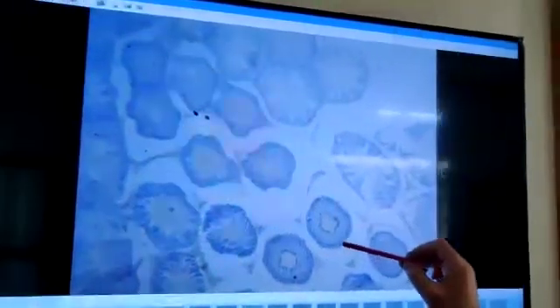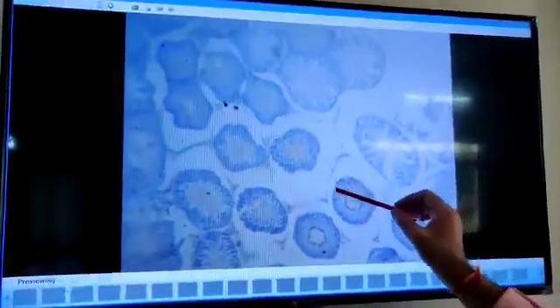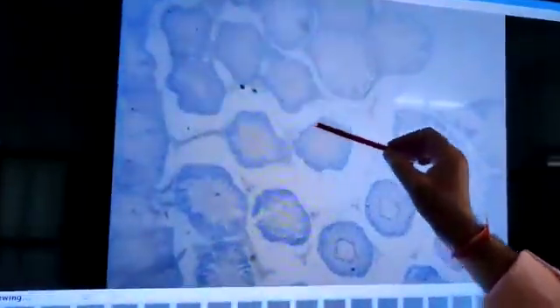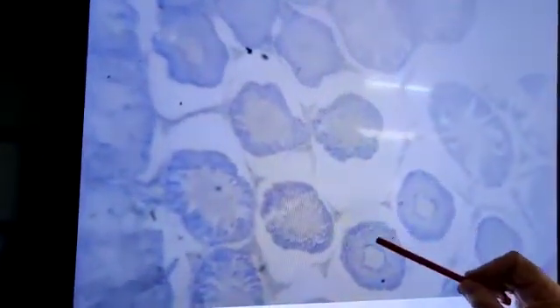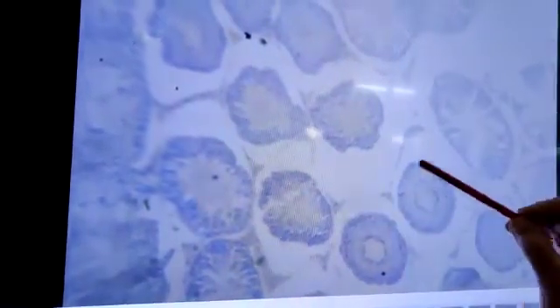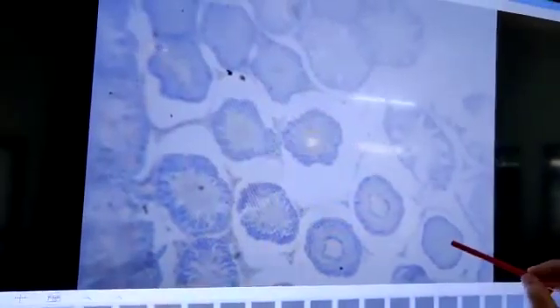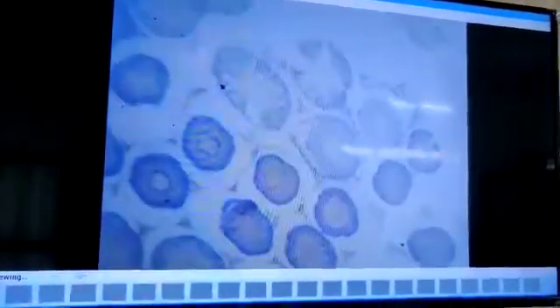In seminiferous tubules, the outer covering is of germinal epithelium or spermatogonia. These are the different stages of spermatogenesis, and some elongated cells are there — these elongated cells are Sertoli cells which provide nutrition to developing sperms. Mature sperms are collected in the center of seminiferous tubules.